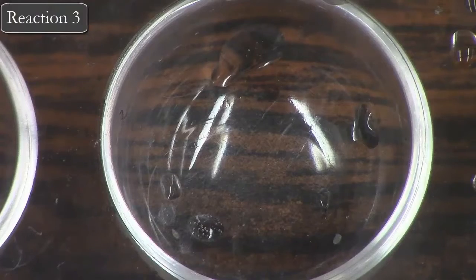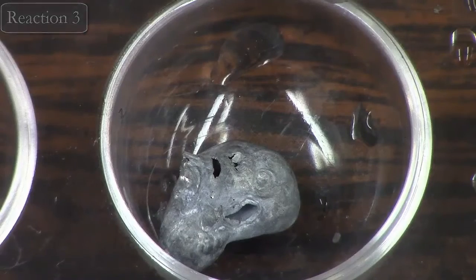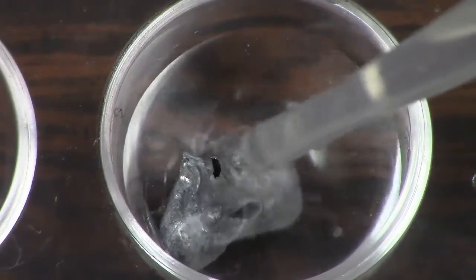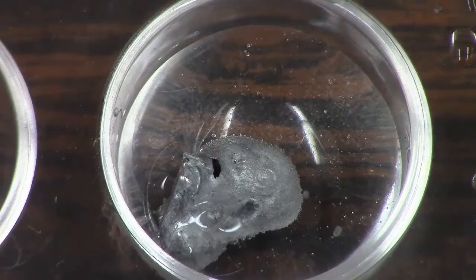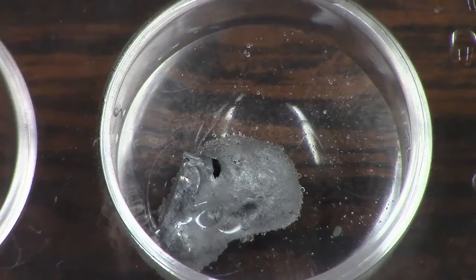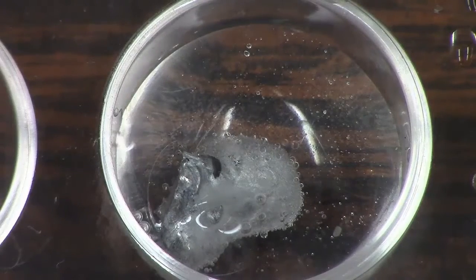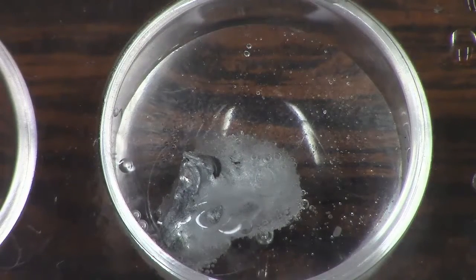All right, in our third reaction, we're starting off with a small piece of solid zinc in our well plate, and then in that same spot, we will use the pipette, and we're going to add a few drops of hydrochloric acid solution. This is a bit of a slower reaction, but observe what is happening here, and based on that, predict what products might have been formed. We started with zinc and hydrochloric acid. Remember the signs of physical versus chemical change.